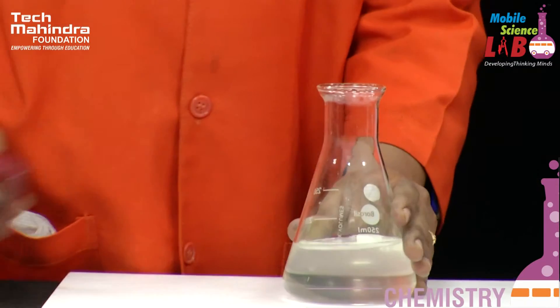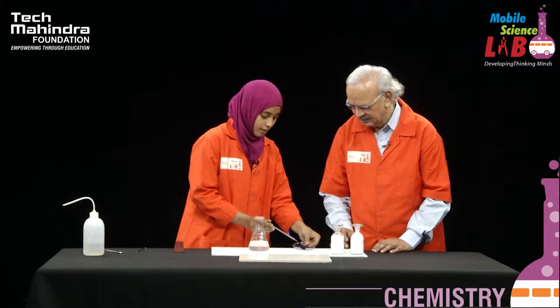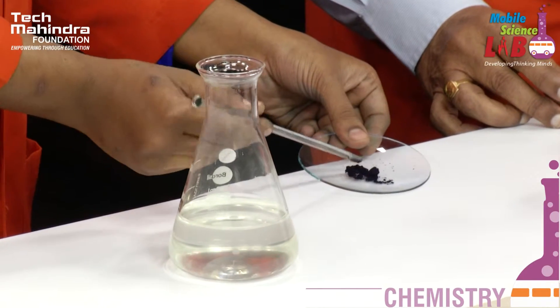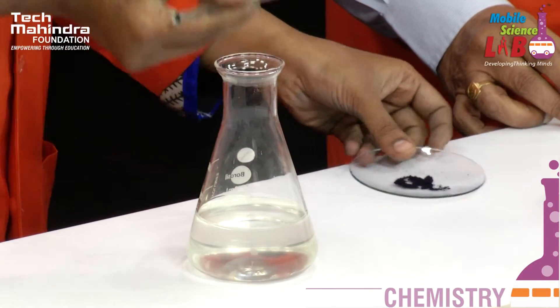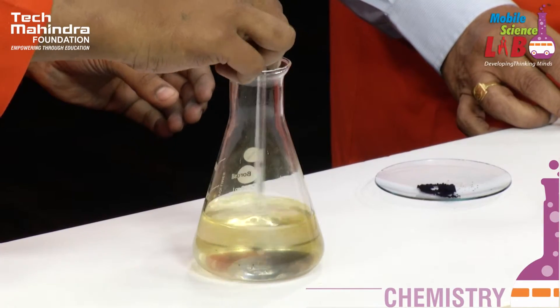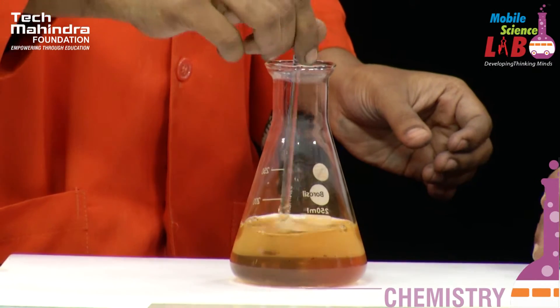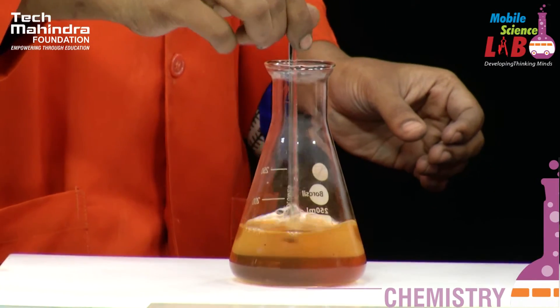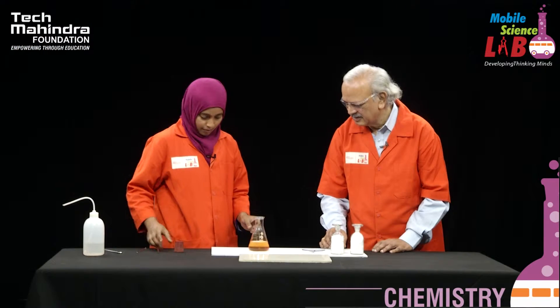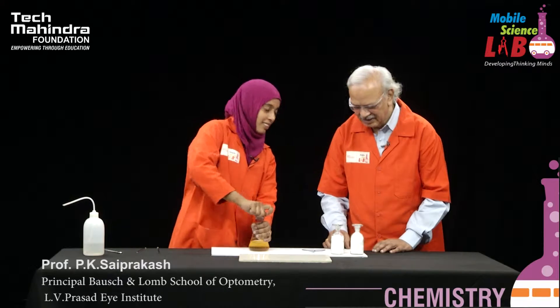Yes sir. And the last one is our indicator. A very little amount of indicator I am using — indigo carmine. Yes sir, it is indigo carmine. It should be all right sir. It is enough sir. I think so. Intensity is good. Yeah. So I must shake it — shake it thoroughly.